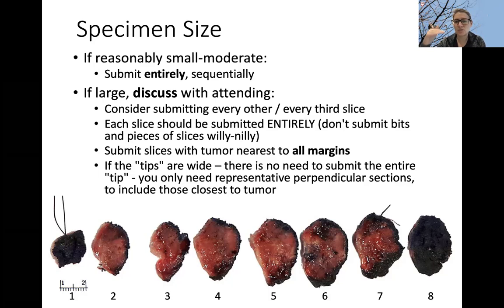If you're doing representatives of the entire specimen, you can also do representatives of those tips. Does that make sense? Okay.